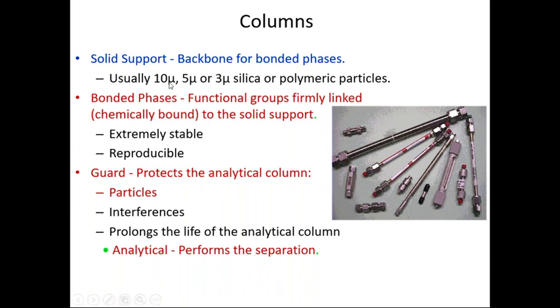These particles are bonded phases, chemically bonded with C18, C8, cyanopropyl, diol. And the advantage of this chemical bonding is that you get reproducible results.